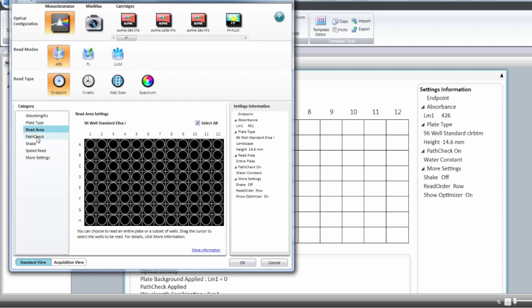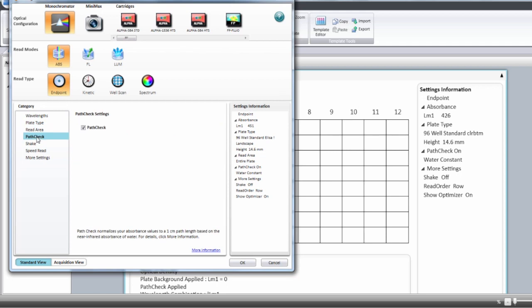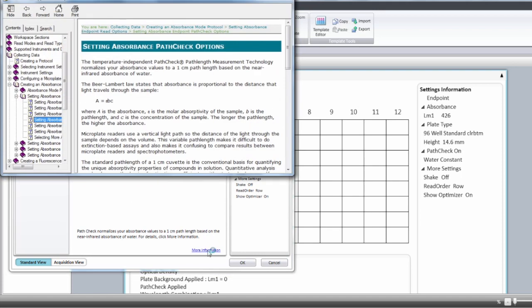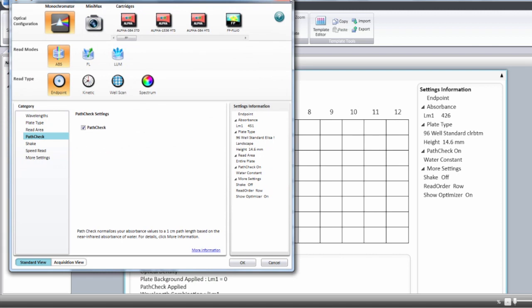You can select the pass check and the pass check will allow you to normalize the data to a one centimeter cuvette. If you need more information on pass check you can select the link that will bring you straight to the manual on the pass check option. We also have application notes on pass check.